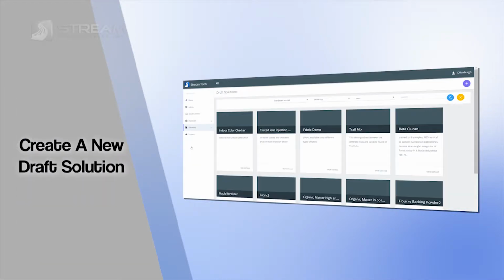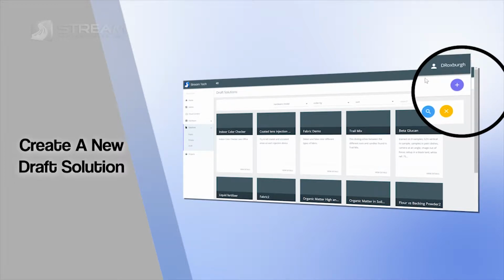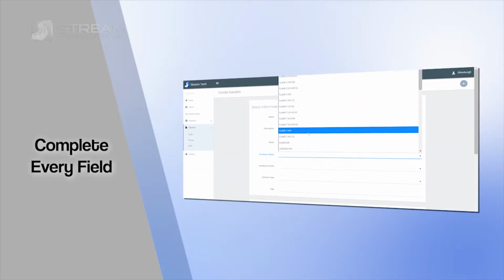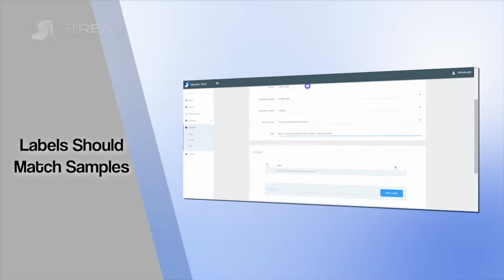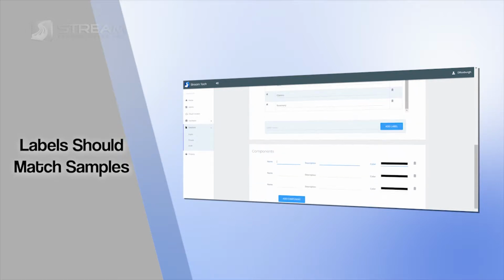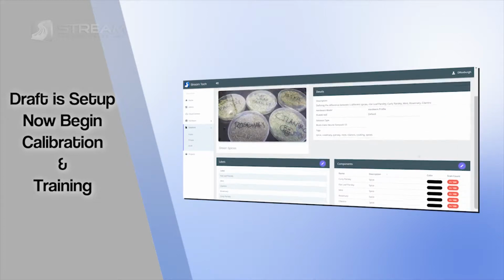Here you'll find a list of all the draft solutions that are available at your company through your Stream Analytics website account. If you want to add a new one, hit this plus button in the top of the screen here. Now we get this basic information screen where you have to type in all the information about the solution you want to make. All these fields are mandatory, so you'll have to type them in. So at this point our solution is set up and ready to go, and we can connect back to the LabFlow box and start measuring samples.